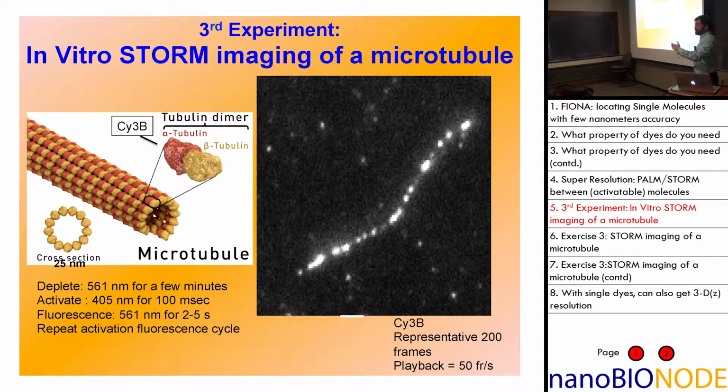But if, for example, you have this GFP that's non-fluorescing, it's off, then you shine 400 nanometer light, just one of them comes on, and as long as it's photostable enough, you can get out a good number of photons.